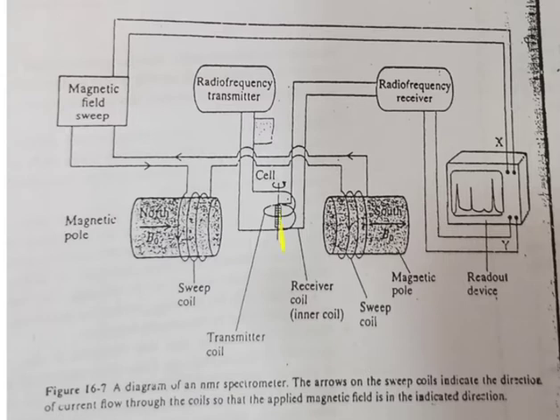Then see, the sample is here. The magnets are kept here. Then the magnetic field is either increased or decreased, or it can be controlled by using the magnetic field sweep. Then the radio frequency transmitter is there. Here the radio frequency receiver is there, and the readout device. Same diagram as the previous diagram. Around the sample there is a coil and the cell is continuously rotating. The magnetic field is applied and the radio frequency transmitter is there.